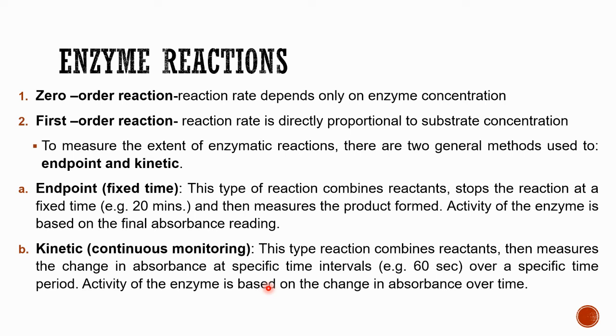So for kinetic, hindi lang once siya i-read. So i-read mo siya ng paulit-ulit over a specific period of time. Then you will get your result by yung change in absorbance over time. Okay? So again, for endpoint, i-read mo siya at a fixed time. Sa kinetic naman, i-read mo siya multiple times at a specific interval.